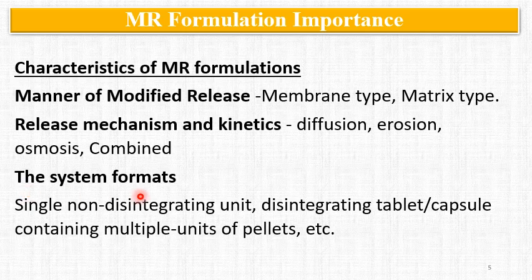The system formats may be single or multiple, like in the previous slide we have seen single non-disintegrating unit like osmotic tablet or matrix tablet, or disintegrating tablet or capsule containing multiple units of pellets. So these are disintegrating type of formulations.